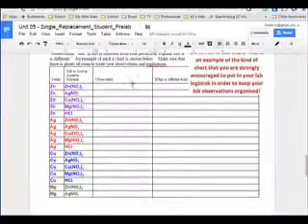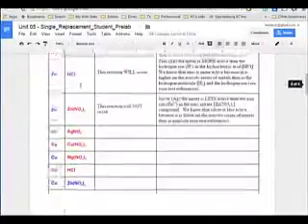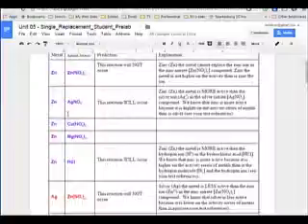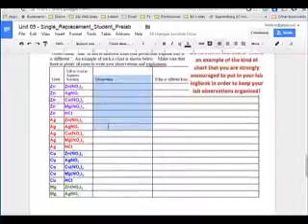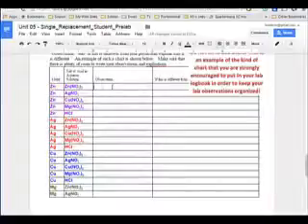If you notice in the first column here, I've got metals listed. In the second column, I've got all the solutions. It's just the same set of information as in this chart up here. But I've got a couple different columns here. This column is for observations. So in the lab, you're going to have a place for observations. Now, when I put it here, I didn't leave a lot of space for observations. You've got to leave a lot more room for observations in your lab logbook, and that's why I'm taking the time to help you see that. So let's go to your lab logbook and let's make some columns here of this data. So let's see. We had zinc up here, and we had zinc nitrate.